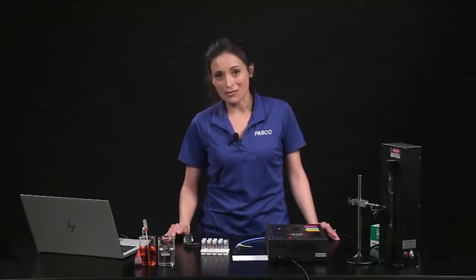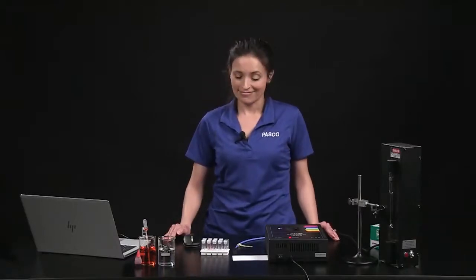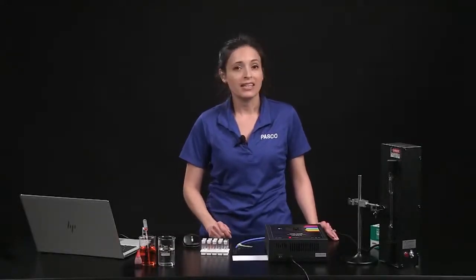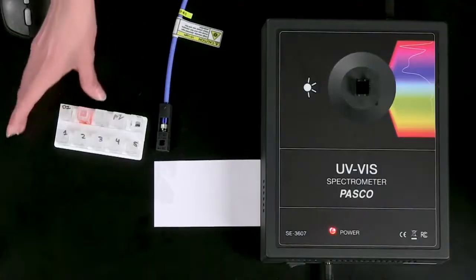You will need version 2.3 or newer of the free spectrometry app to use with the UV-VIS spectrometer. Download the latest version from PASCO.com. The spectrometer comes with 10 disposable semi-micro cuvettes usable down to 220 nanometers. The cuvettes come with lids and a cuvette holder.